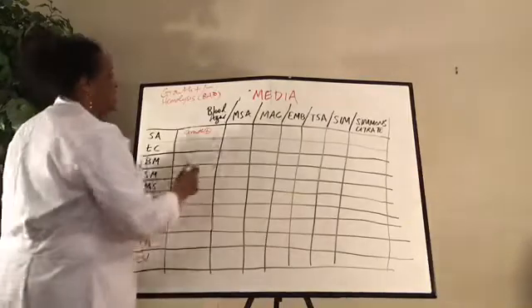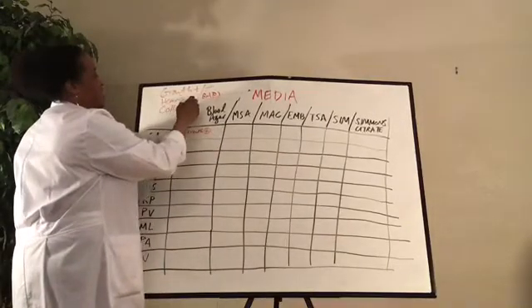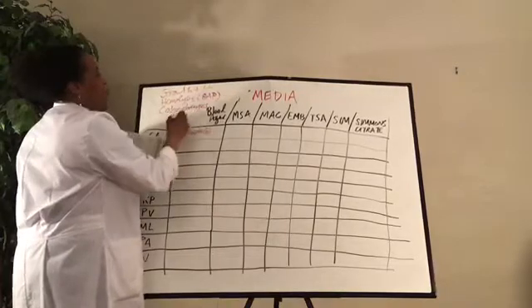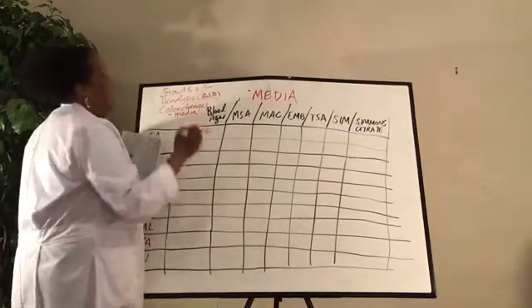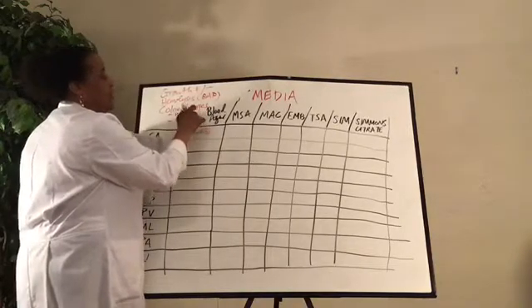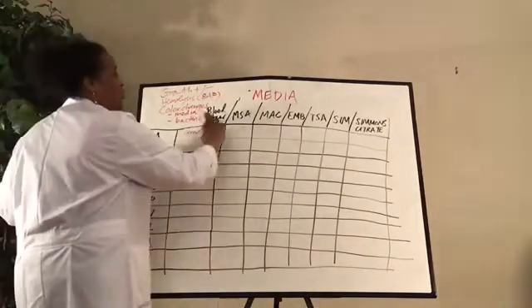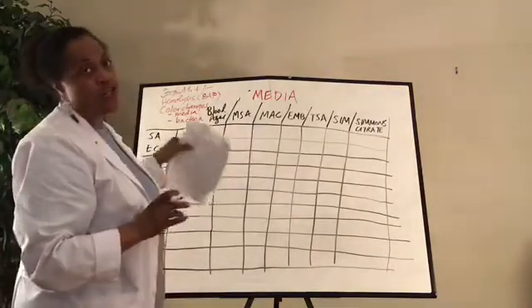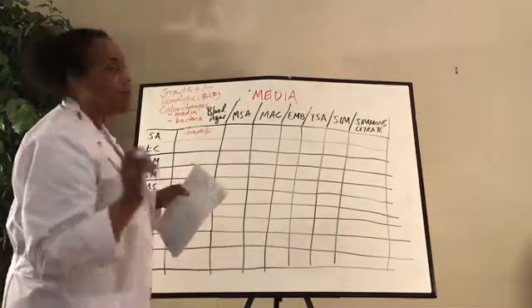Color changes. I want you to note, did you have any color changes with the media? Did the media change colors? Or did the bacteria? Or maybe the media and the bacteria both changed colors. Please indicate that in these squares, which should be a lot larger than this. Please make them larger.